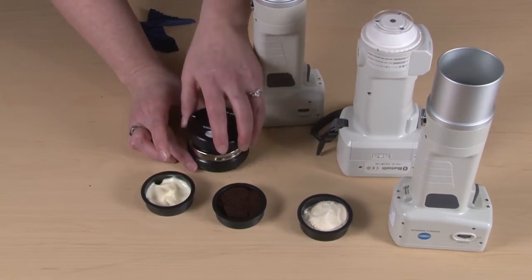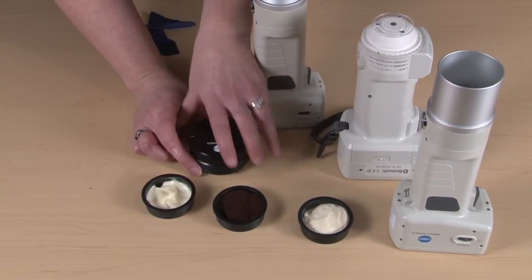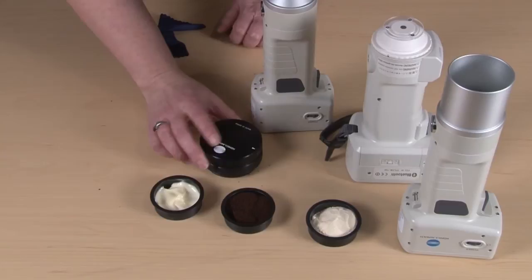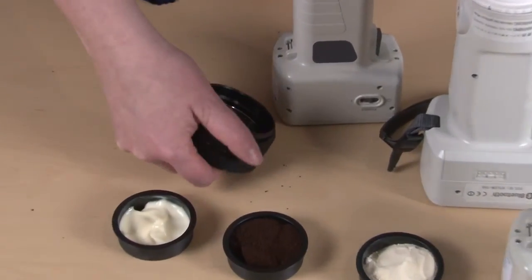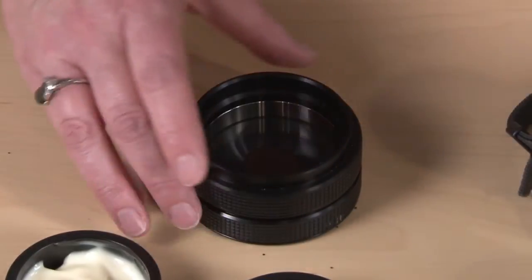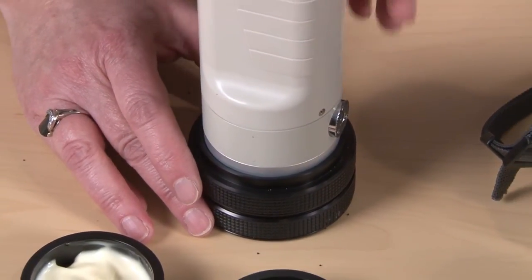Now you just simply put your cap on. You're going to line it up with the collar. You see the two knobs here — you're just going to put that in and twist it clockwise. Now you have a perfect sample for presentation to the instrument. Take your measurement and you're done.